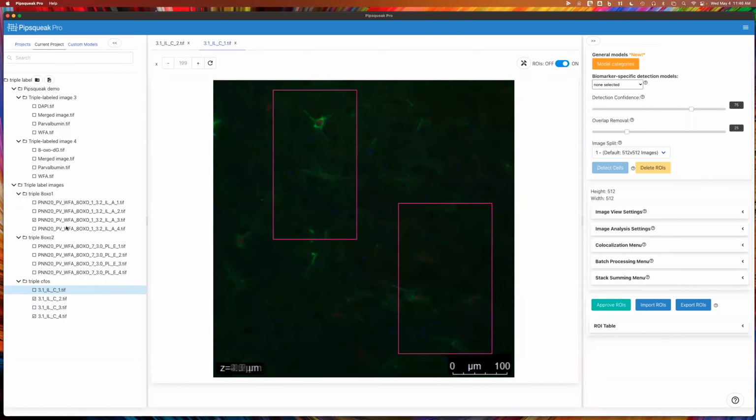Yeah, hi. So I would have images, an image with both red and green fluorescence inside the same image, and I want to be counting the number of those areas, red or green, and also getting the area.